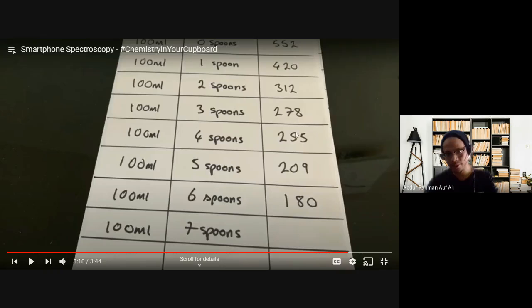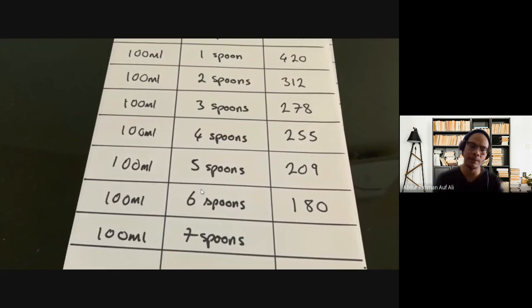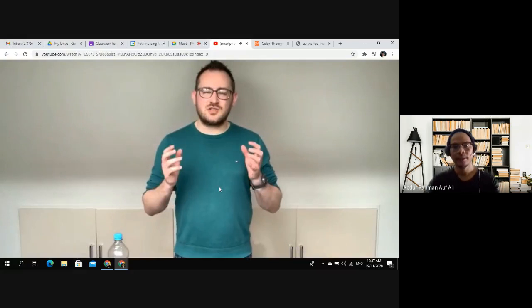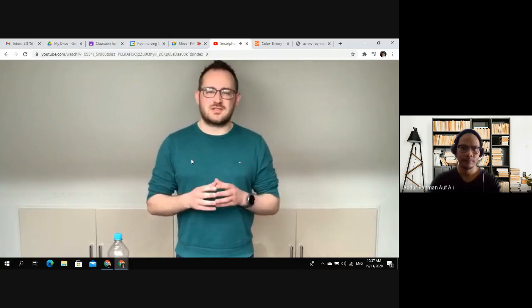Bacaan light. Okay, kenapa lower? Because semakin banyak cahaya diserap. Kenapa semakin banyak cahaya diserap? Because in higher concentrations of solution, there are more molecules to absorb light. Okay, so that is how we measure concentration. There are the equation here. I will show you later. And it is also available in the lab manual, Beer-Lambert's law. Okay. So that is how we measure concentration using the spectrophotometer.